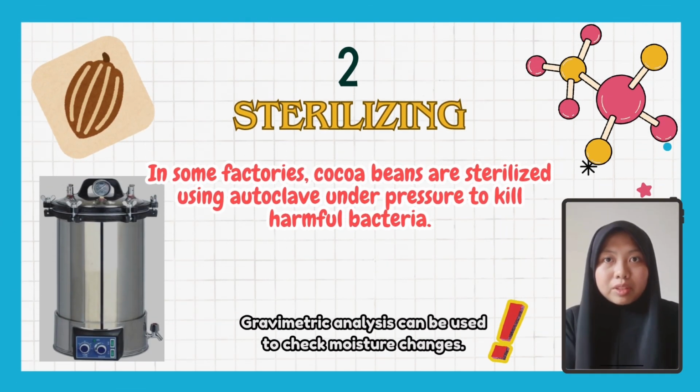Second, the sterilizing part. In some factories, cocoa beans are sterilized using an autoclave. This device uses steam.